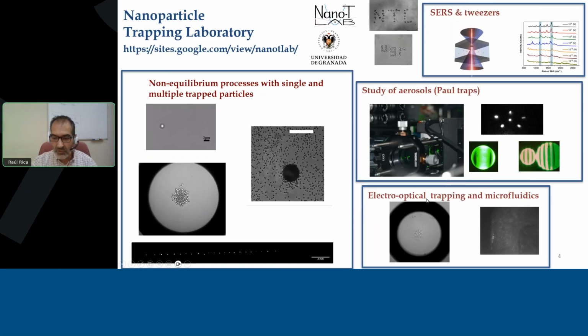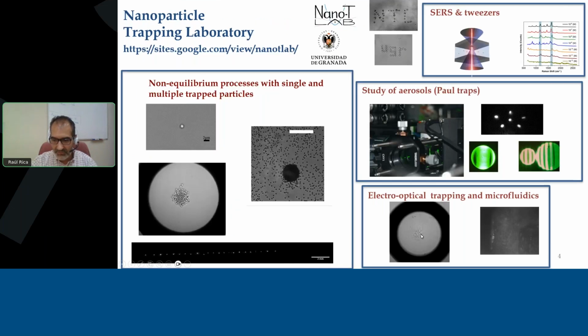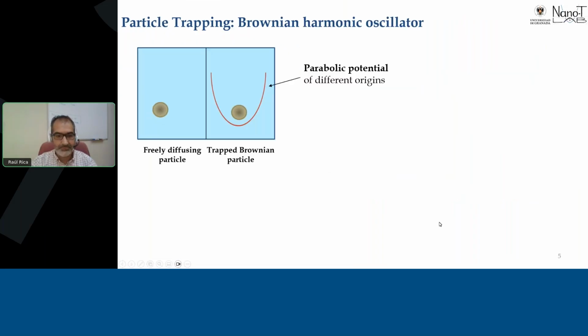And finally, we also combine laser light with electric fields. Sorry, this video doesn't work. But we also combine electric fields and the lasers from the tweezers to get enhanced manipulation capabilities, as I will show you later. Okay, so most of the discussion I will share with you today is about particle trapping.